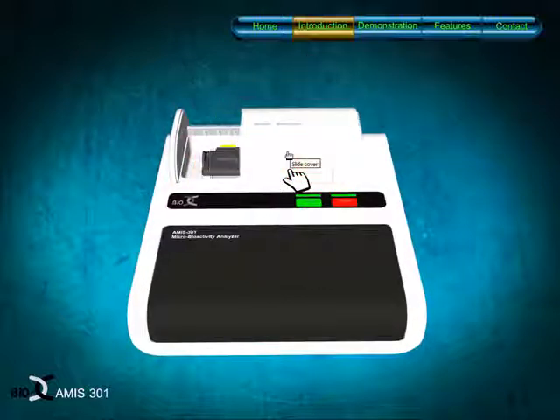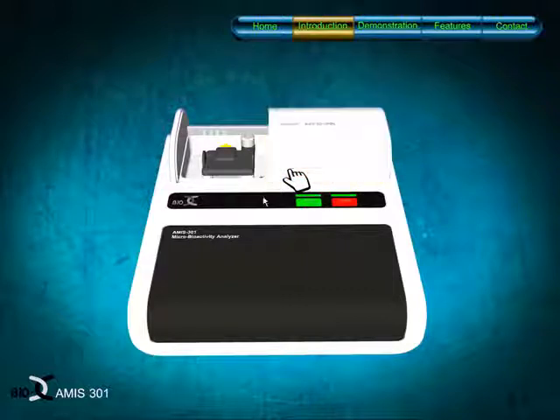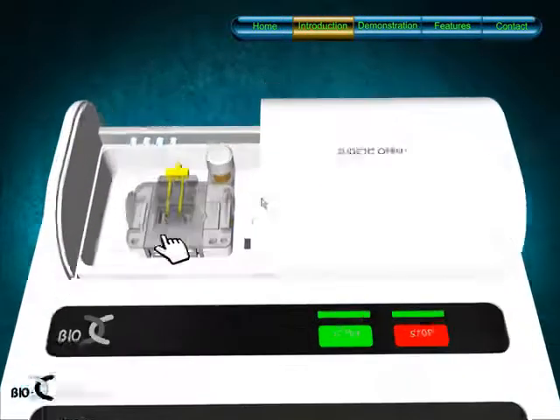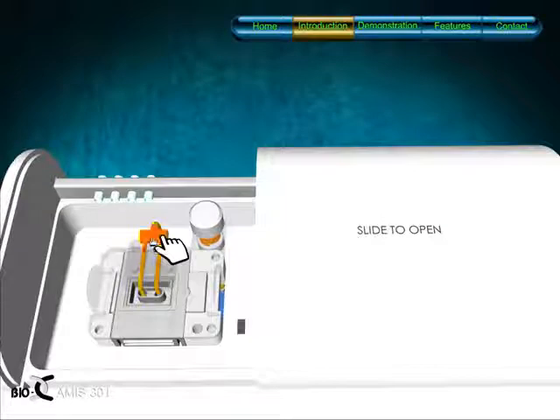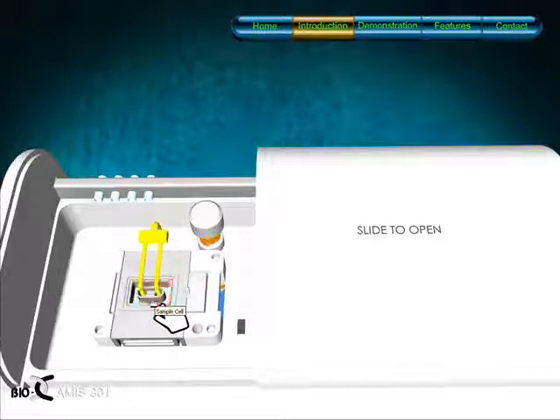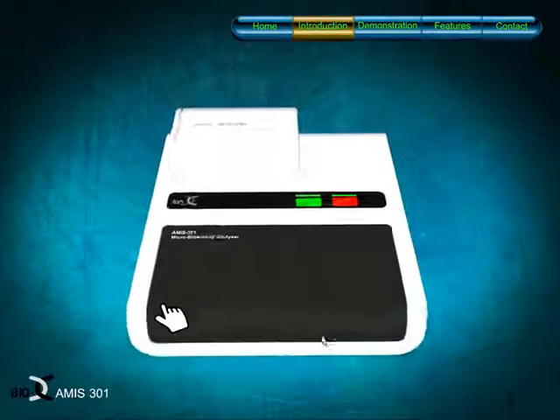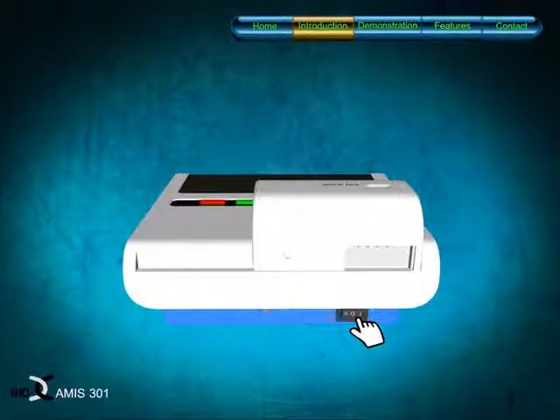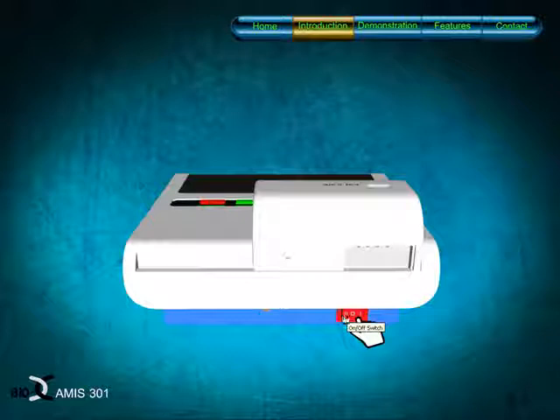This is the slide cover. This is the electrode. This is a sample cell. This is the power on-off switch.